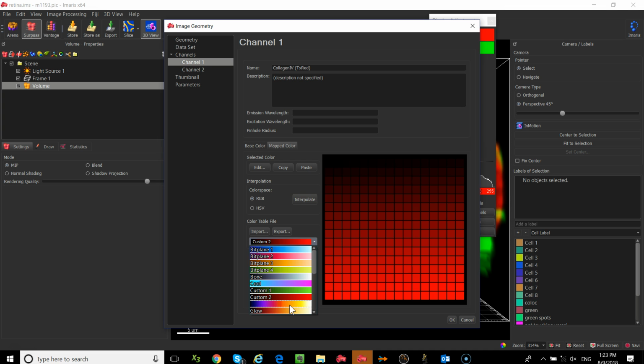You mean like a scale bar? Yeah. Okay, so no, there's currently no way to apply a scale bar for that. That would purely be just a visualization tool to look for differences and changes. However, I can add that to our feature request list and see if that's something, if you would be interested in that. Okay?